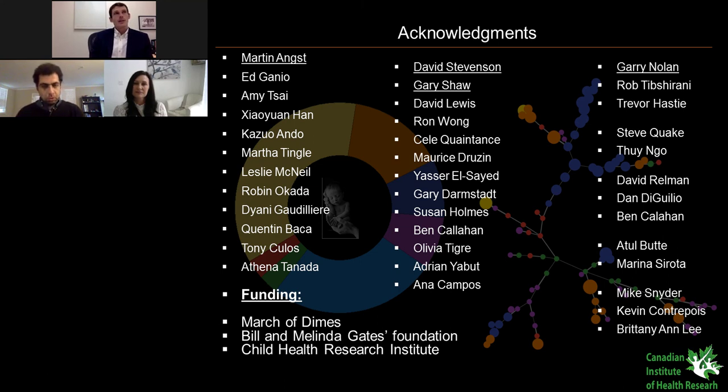And so in order to get to this question, we have recently engaged in a collaboration with the University of Chicago with Carole Ober. And she has started using mass cytometry to analyze the immune landscape, or the cellular landscape actually, of the placenta, using both the maternal side and the fetal side of the placenta at the time of delivery.